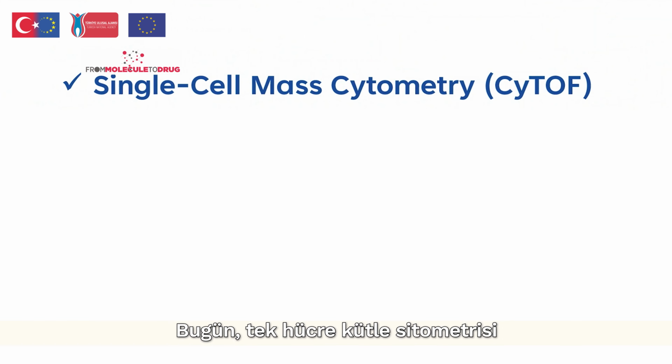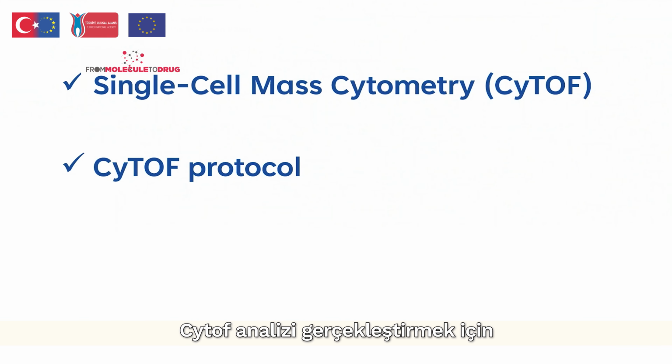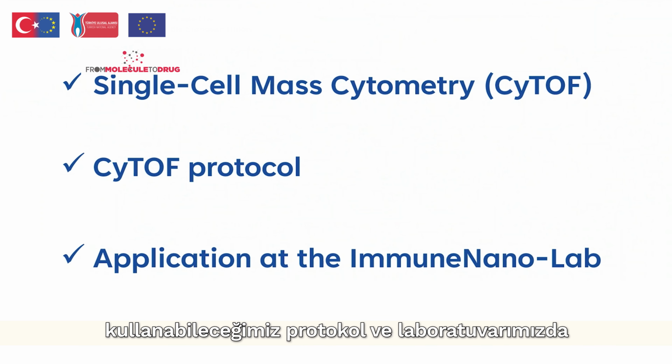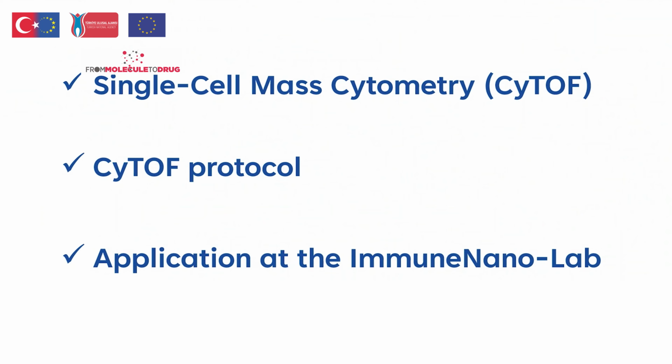Today I will be talking about single-cell mass cytometry or CyTOF, the protocol that we can use to perform a CyTOF analysis, and an example of CyTOF application in our laboratory.